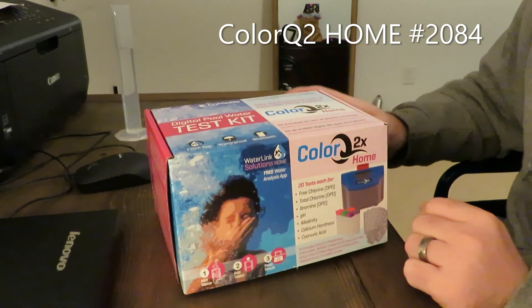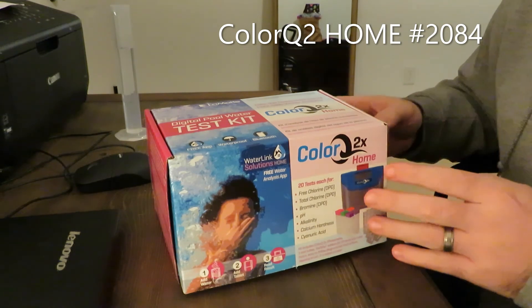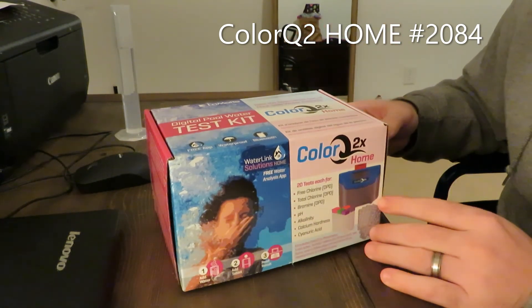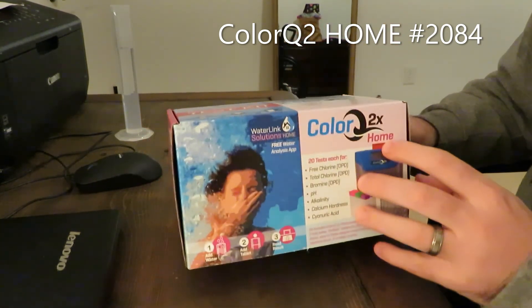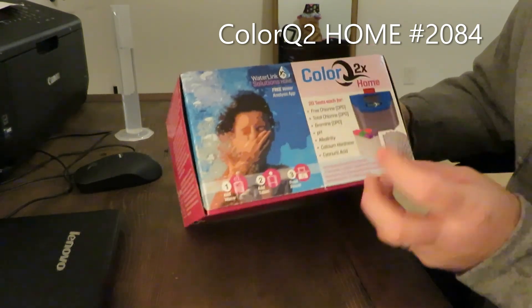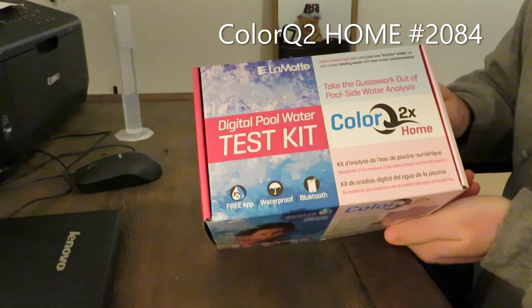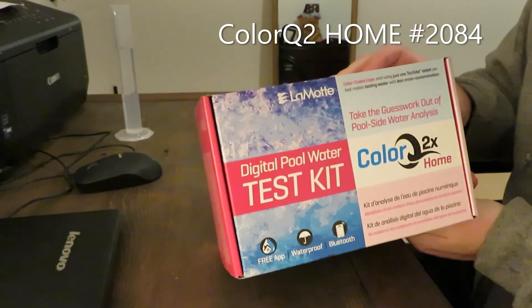I should also mention it's waterproof — anything near a pool, if your product's not waterproof it's not going to last very long. So this was the ColorQ 2X home edition, brought to you by LaMotte. It could be a little easier to use, but overall it's a pretty cool product. I liked it.